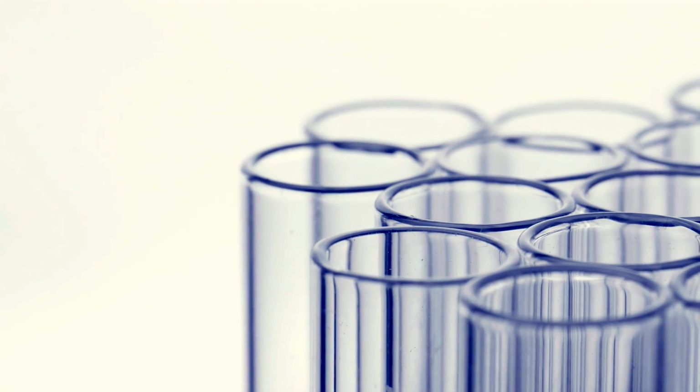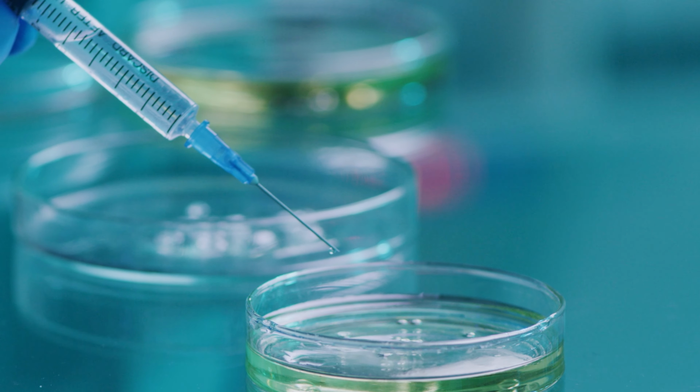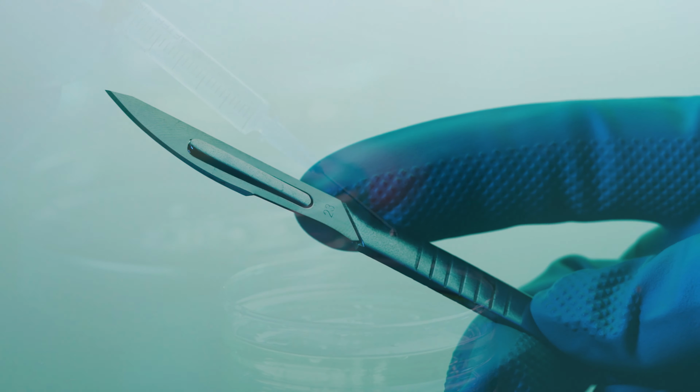Lab safety is our #1 priority, and that includes being careful with sharps, which are items that can puncture the skin, like needles, scalpels, broken glass, capillary tubes, and razors. When using sharps, remember to handle them with extreme care to avoid cuts. Sharps also run the risk of injecting foreign materials into your skin, such as chemicals or pathogens.